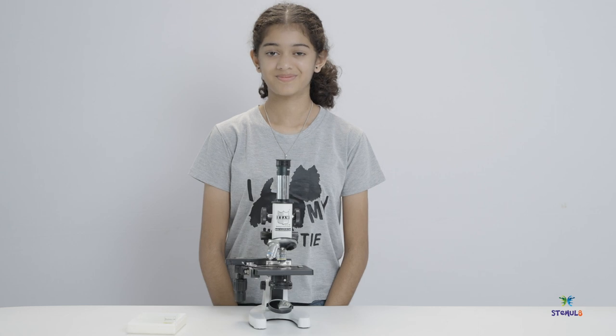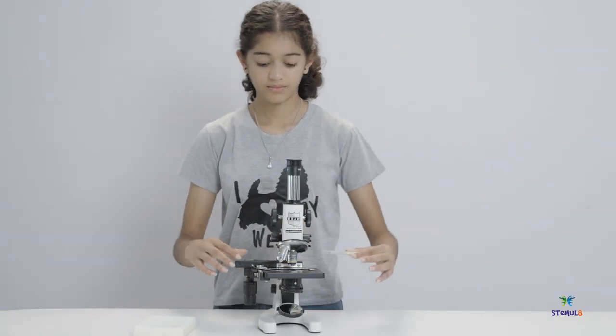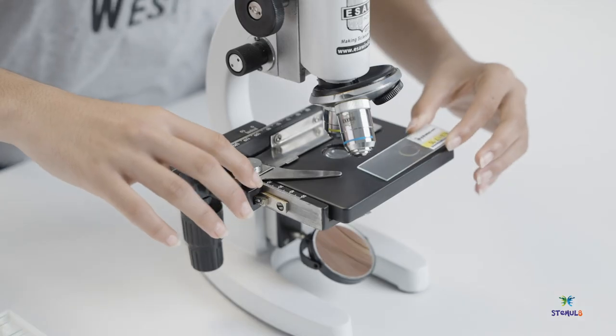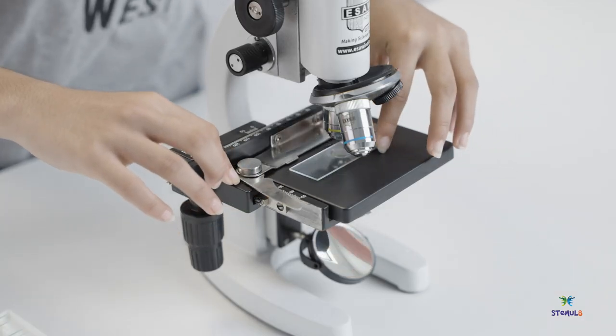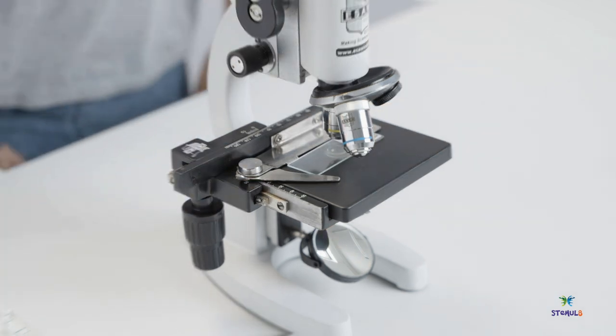You are ready now to mount your specimen on the stage. Press the rotating lever on the stage and place it in a 90-degree corner of the slide holder. Then release the lever. This will hold the slide.